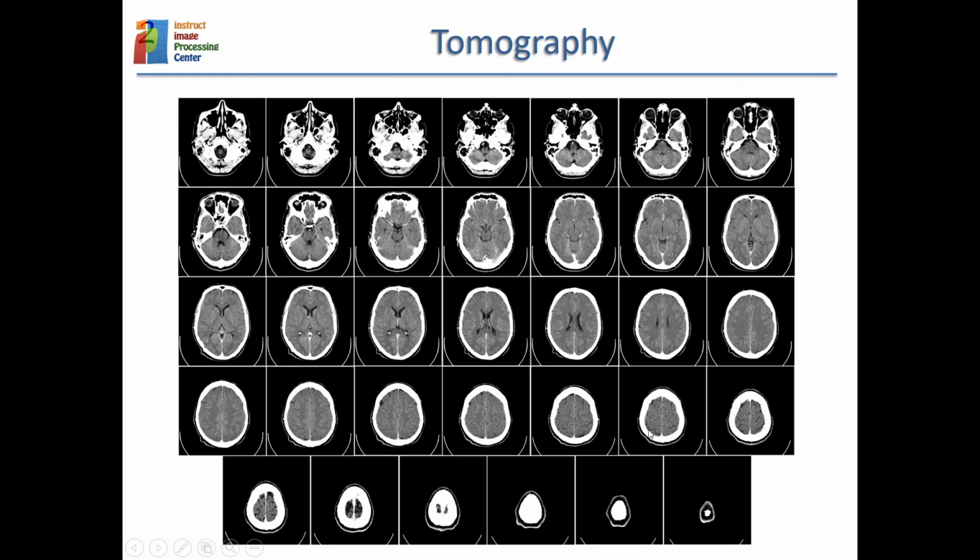Okay, we may also take the same object and present all the consecutive slices. So for a head, we would see these ones, and this is exactly what we do when we are presenting a volume in CryoEM.